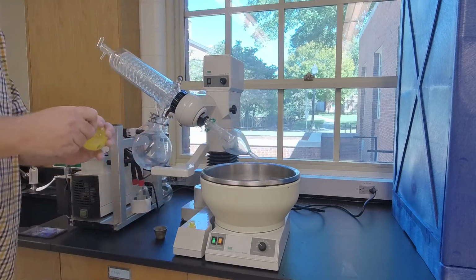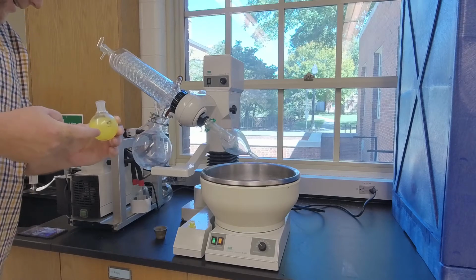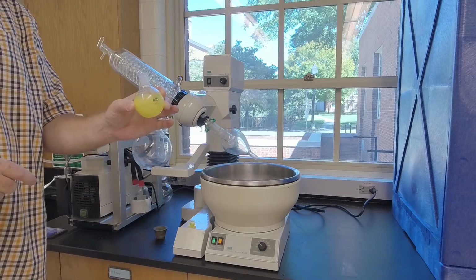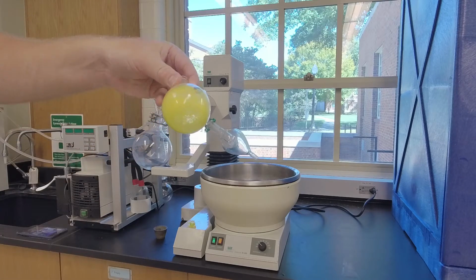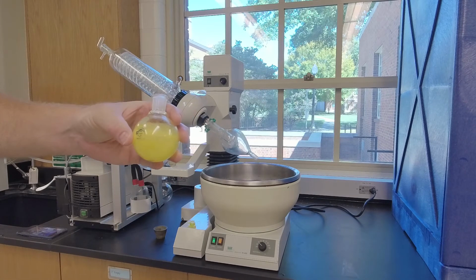Now, hopefully you've weighed this flask already, and you can go weigh it. If I know the weight of the flask, I can weigh the two together and I know how much solid is in there. So before you rotovap, always weigh the flask. But anyway, look at that. Isn't that cool? Yellow solid. It was a yellow solution, now it's a yellow solid.